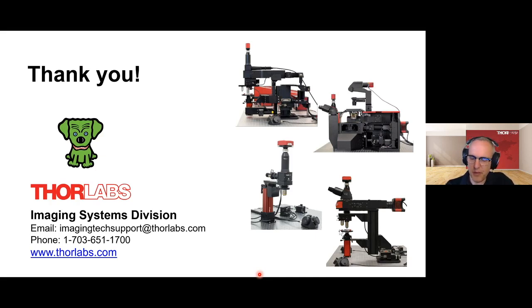But the other aberrations, everybody else can step in and correct me if I'm wrong, but I believe you cannot correct with the computer. So you're going to want to make sure that your scan engine can achieve the imaging capabilities necessary on those other aberrations.